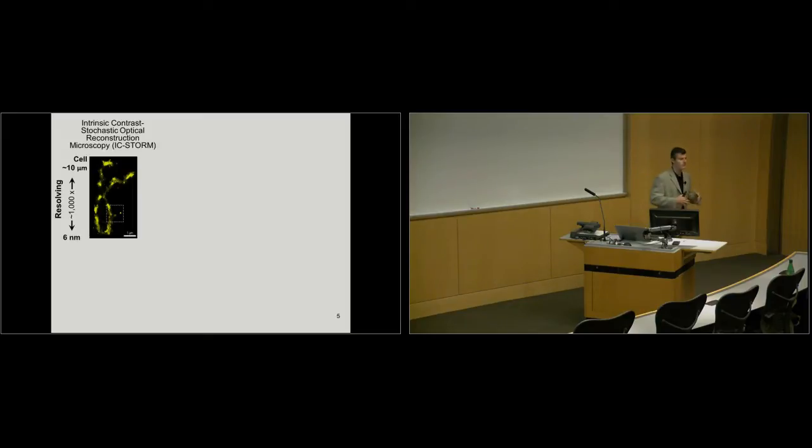All right, so the approach that Nanocytometry Core took is essentially to build a platform of optical technologies with a trick. It combines spatial resolution, which doesn't require labels, with essentially spectroscopic sensing. So the idea here is that for each resolution voxel, we can acquire some sort of spectroscopic data and measure processes which otherwise would not be visualizable directly. And using this approach, you can go below the diffraction limit.